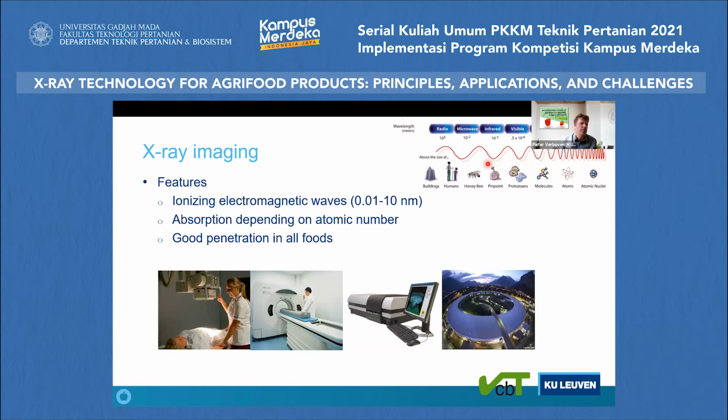It also allows it to penetrate very well into materials. As opposed to light, which is not able to penetrate that far into material, limiting its capabilities for doing quality assessment, X-ray can penetrate very well through materials. And then finally, as X-ray passes through an object, it will, by its interaction with the atoms, be absorbed by the material. It's actually this absorption that you will take benefit of.